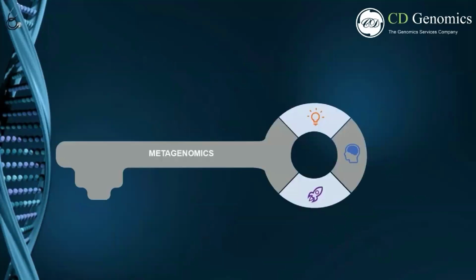The obtained community taxonomic profile can provide massive amounts of information on genomic assembly, gene prediction, and species diversity. Comparative metagenomics can provide additional insight into the function of complex microbial communities and their role in host health. Therefore, metagenomics has the potential to advance knowledge and solve practical challenges in a wide spectrum of fields, such as infectious medicine, engineering, agriculture, sustainability, and ecology.